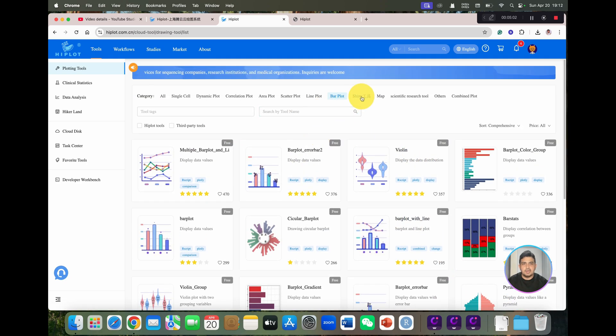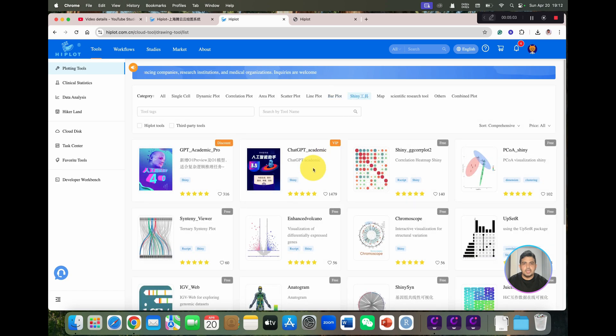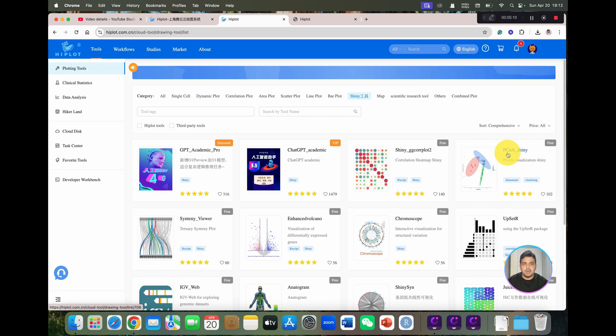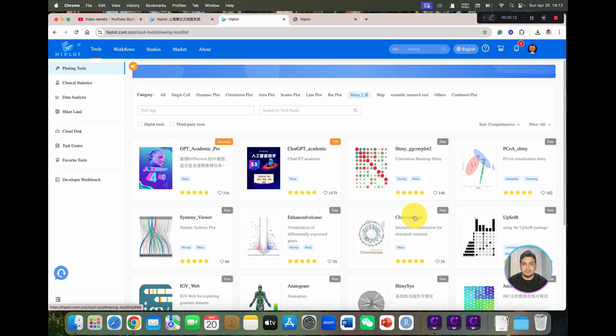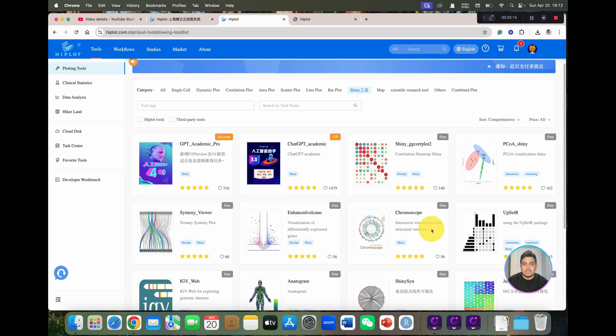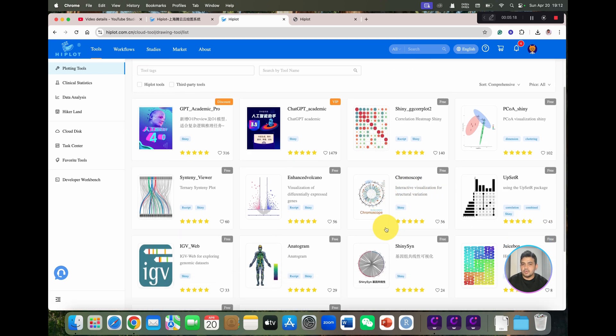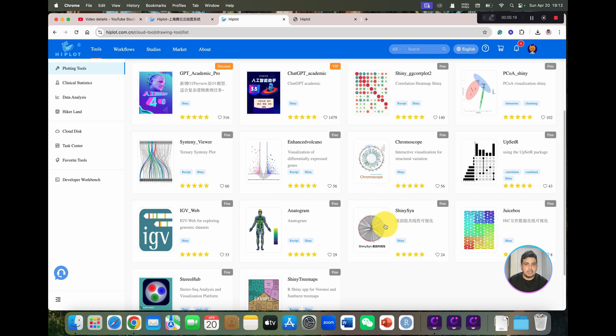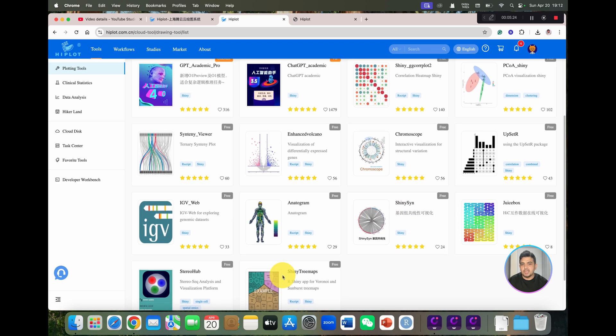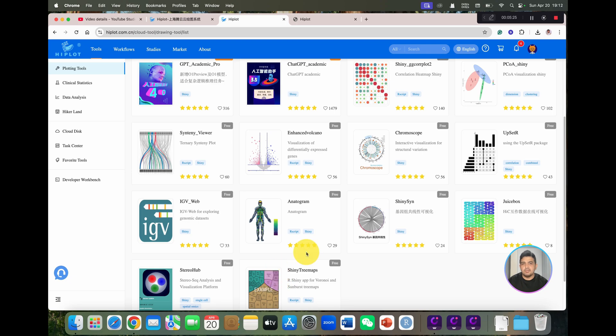If we can go to Shiny app, you can see here we can even view synteny, we can draw PCoA Shiny tool, and we have interactive visualization for structural variation of chromoscope. Then we have ShinySyn, which was just recently published, and we have Shiny tree maps.